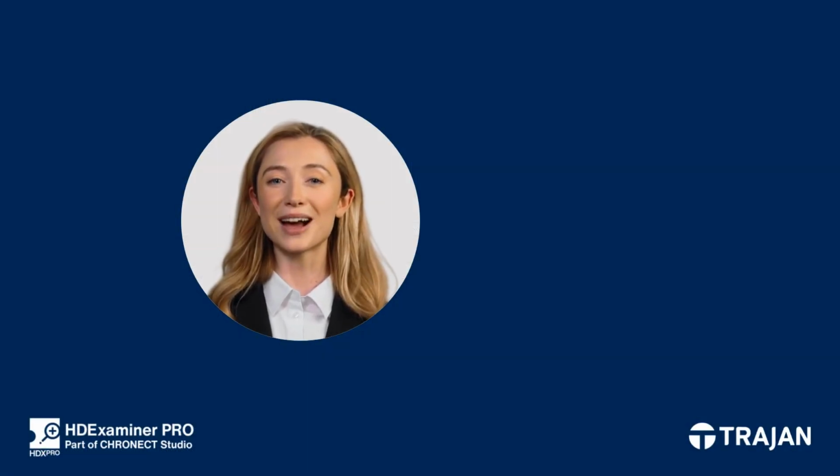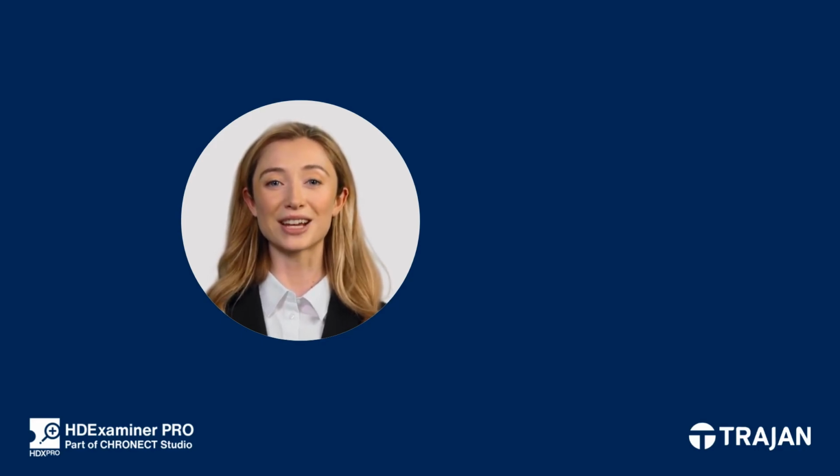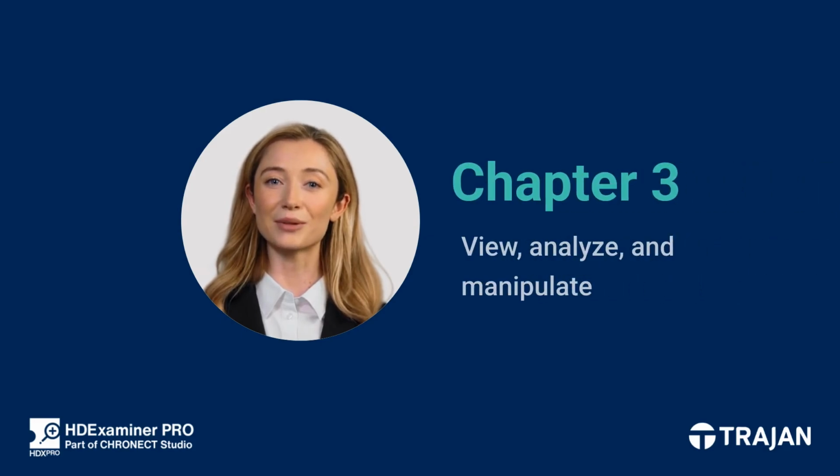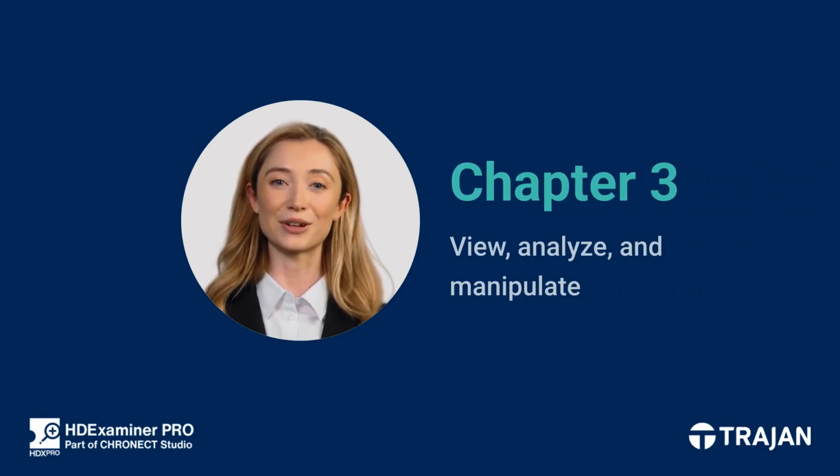Now that you know how to evaluate your processed results, it's time to explore all the powerful tools HDX Pro offers to visualize and refine your data. In Chapter 3, we'll dive into the many ways you can view, analyze, and manipulate your HDX results to get the most out of your experiment. Let's continue.